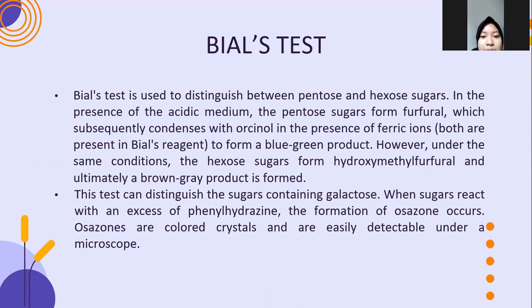This test can distinguish the sugars containing galactose. When sugars react with an excess of phenylhydrazine, the formation of osazone occurs. Osazones are colored crystals and are easily detectable under a microscope.